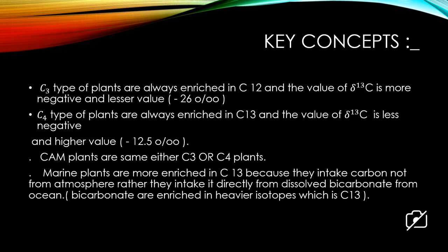The main research question for archaeologists is to reconstruct paleodiet. As I said earlier, they use carbon and nitrogen isotopes. If archaeologists find any bone from an archaeological site, they can first extract samples from it, like collagen and the mineral part. From it they extract stable isotopic data of carbon and nitrogen isotopes.